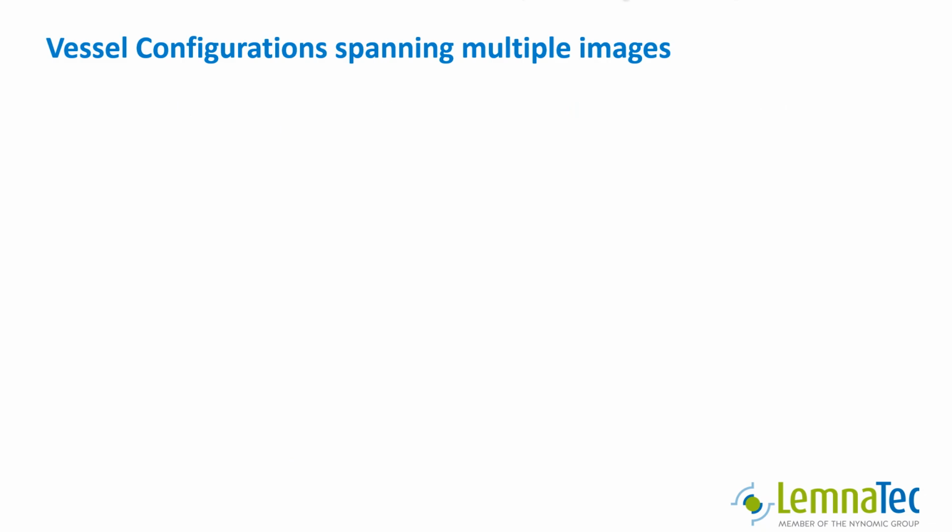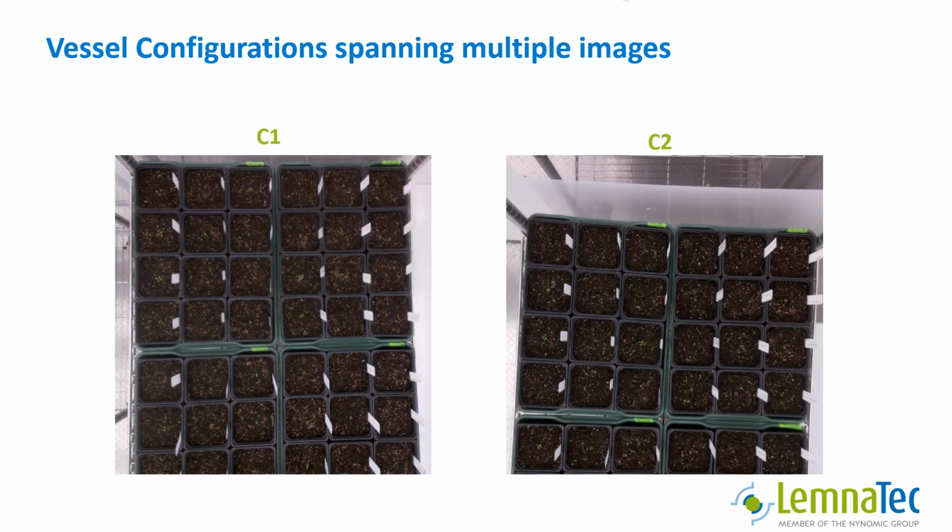The individual scenario. In this scenario, we have no systematics in the placement of the samples whatsoever. Consider, for example, we have 8 plant trays, each with 4x6 plants, but we have only 5 camera positions. So at each position we record more than 1 tray, but less than 2.